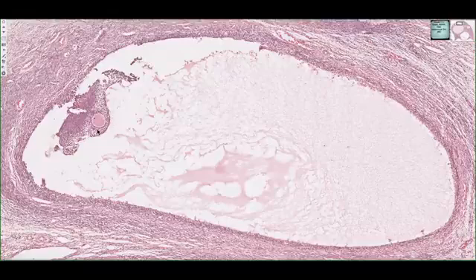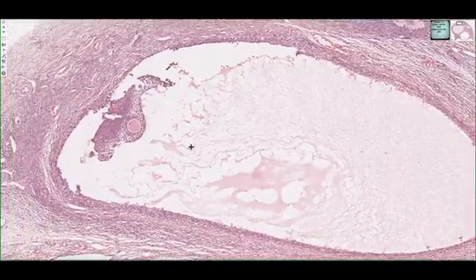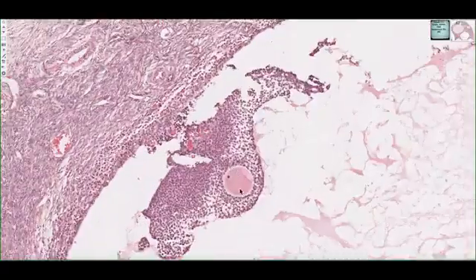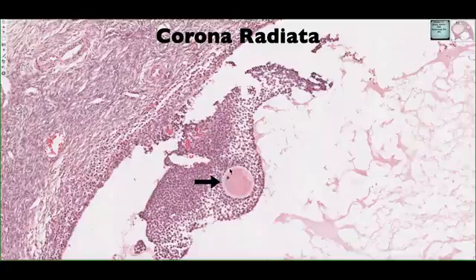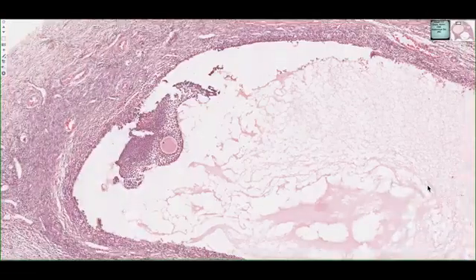There's a layer of cells that is important that is directly surrounding the oocyte. It's a single layer of cells found immediately adjacent to the zona pellucida. This is called the corona radiata, or crown of cells. This is important during ovulation when the oocyte is going to be floating through the uterine tubes. The spermatozoa are going to have to navigate through this layer of corona radiata and pass through the zona pellucida, and a single sperm is going to pass through this passageway to fertilize a single egg. So these are the major features of the mature or Graafian follicle.